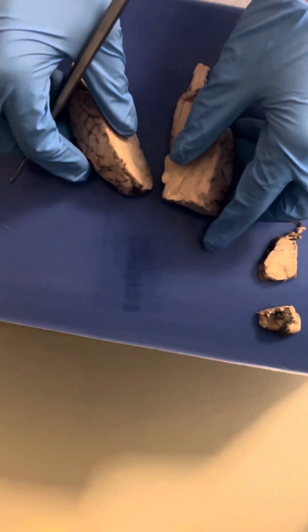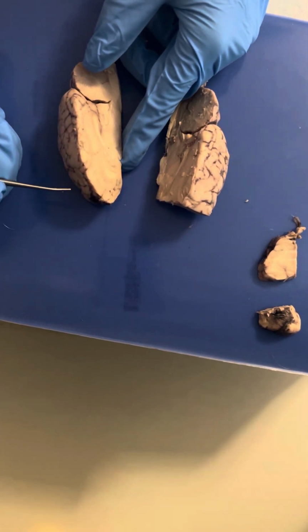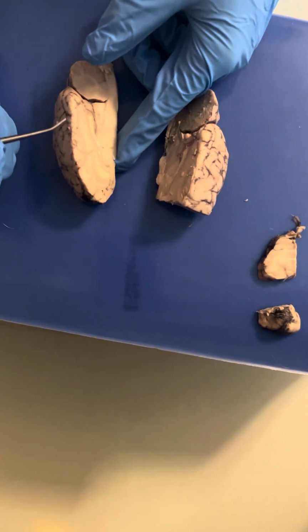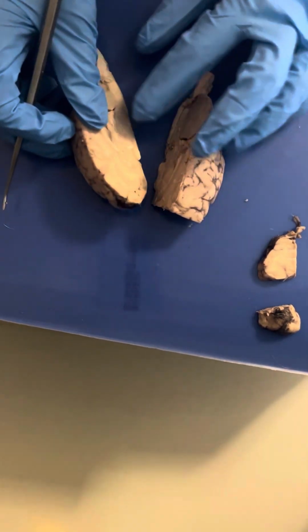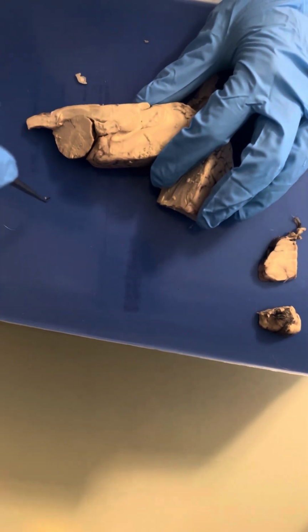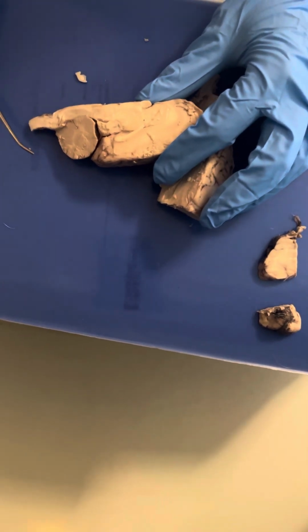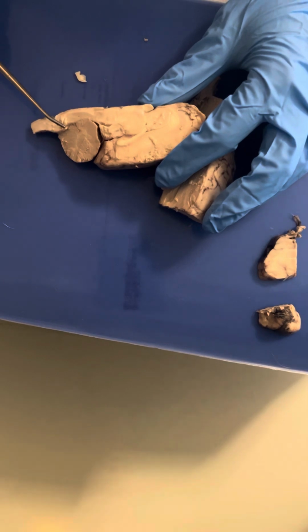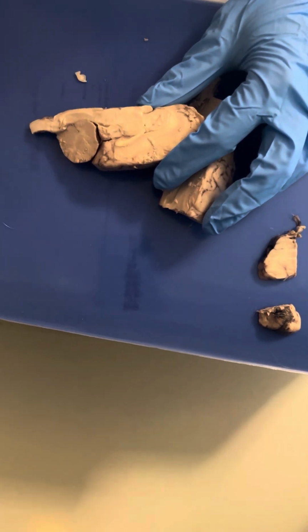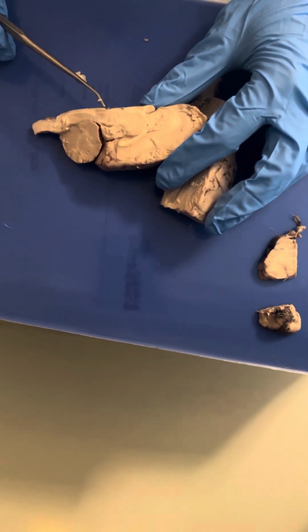So flipping it back over and cutting it down the corpus callosum, we can see the inside of the brain. There are 4 different ventricles that each have the choroid plexus, which helps create the cerebrospinal fluid. Ventricles 1 and 2 are known as the lateral ventricles, and these are filled with the cerebrospinal fluid. And then below the lateral ventricle is the hippocampus.